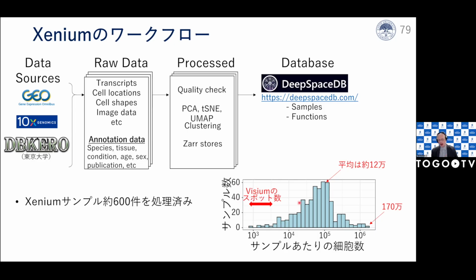So it's maybe 1, 2, almost 3 orders of magnitude bigger sometimes. And so in the database, we have to be able to quickly access the data and show it to the user. So we have to do some preparations to do that quickly.